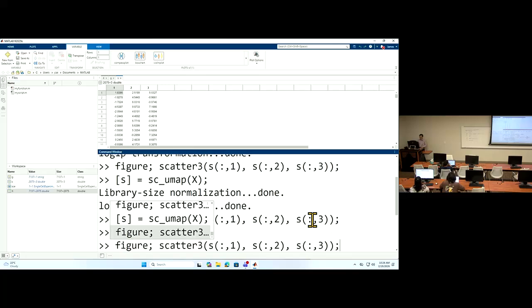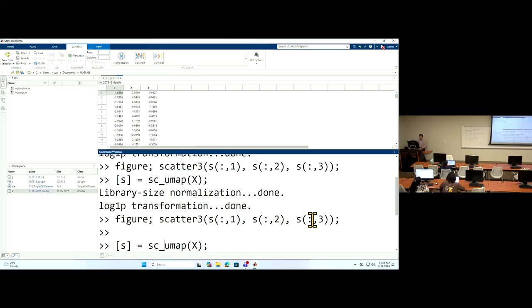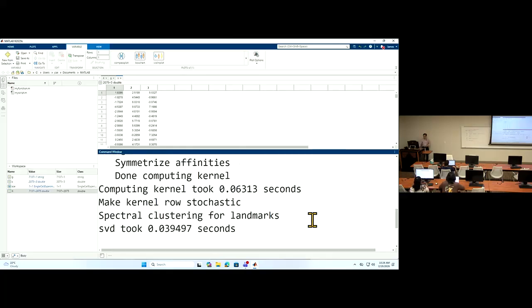Again, the same story. We are going to use FATE. Exactly the same, okay? Same way of calling this function and this get.